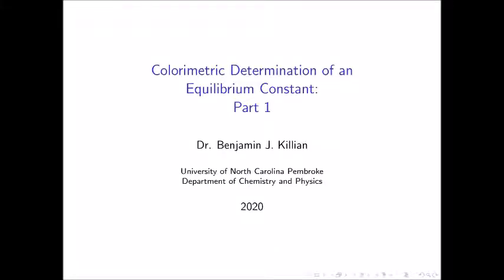In this experiment, we will use colorimetric methods to determine the value of an equilibrium constant for a reaction. In Part 1, we will detail the experiment and collect the data. In Part 2, we will perform the calculations that are required.